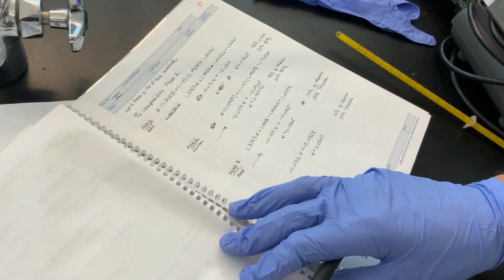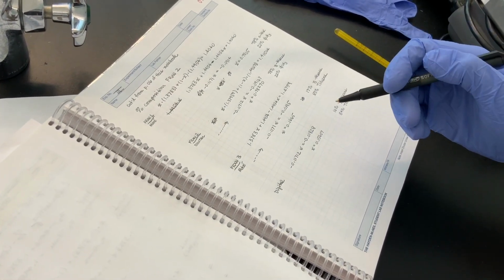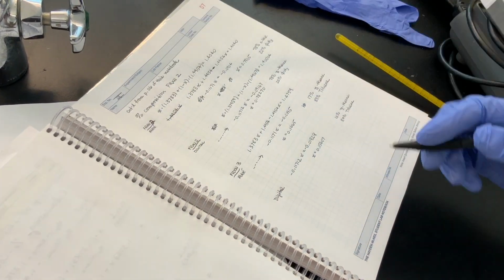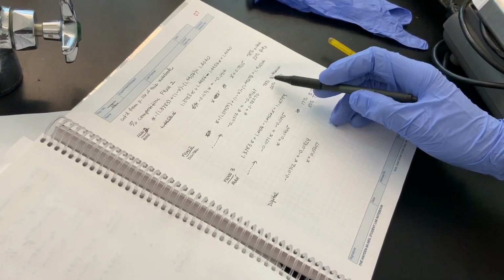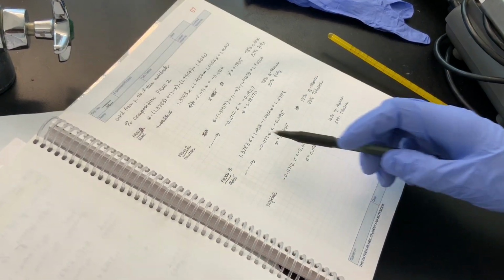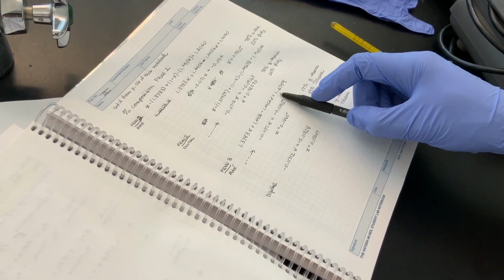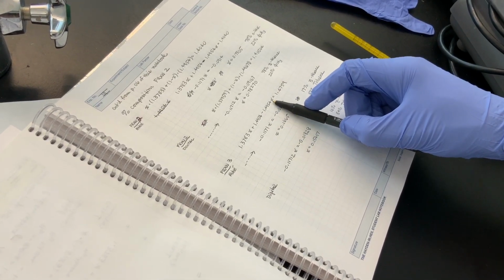For fraction 2, it works out to be 78% hexane, 22% toluene, and that was the case for both the analog and the digital. Fraction 3, which we were more concerned about, we measured 1.4759. Our standard for toluene was 1.4954.